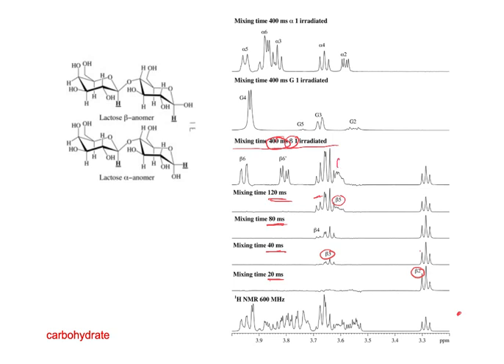we see, so here's beta 5, and here's the 2 beta 6 protons. So in fact, now we're actually seeing the signals with their splitting and everything, and we can see where they're showing up here. So beta 6, it's a little harder to see this other beta 6. Might be these two.